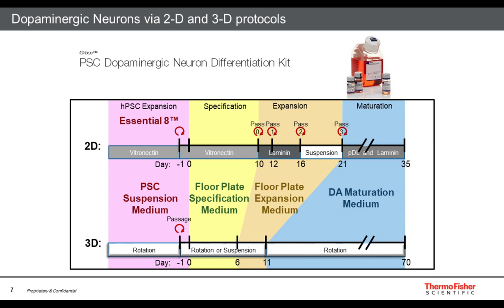So to go back to the workflow slide just for a moment, I want to zoom in a bit on the details of this and talk about a number of variations that we've tried to the protocol in order to optimize differentiation of dopaminergic neurons in 3D.